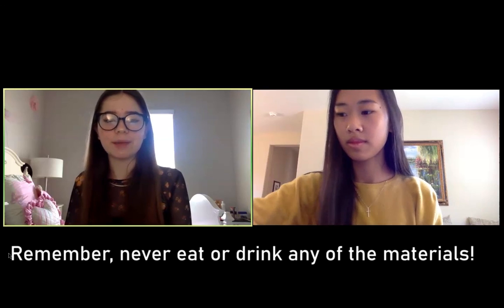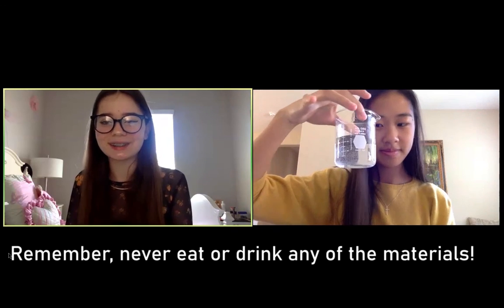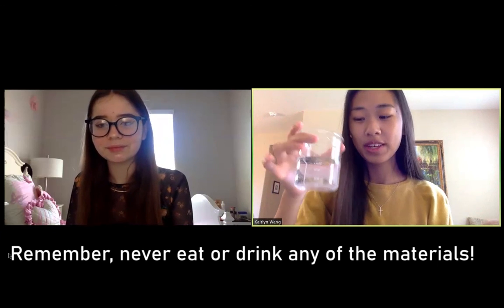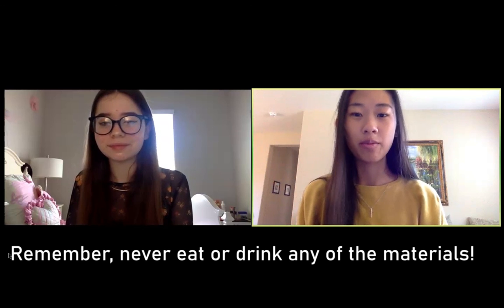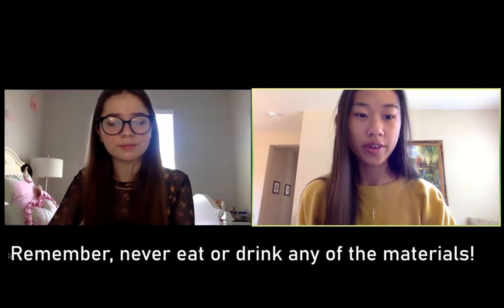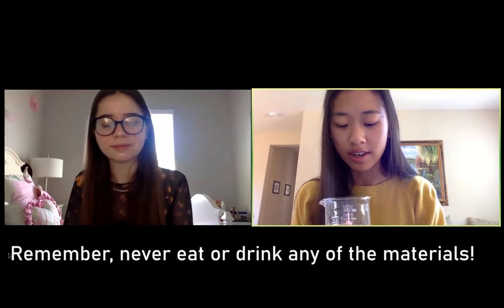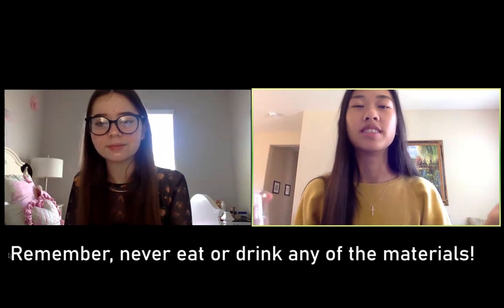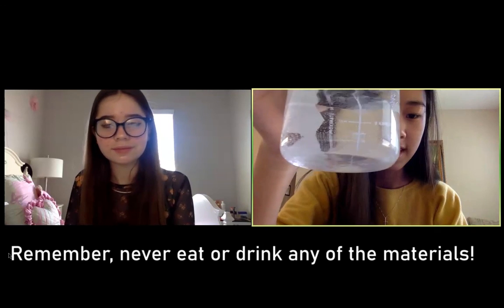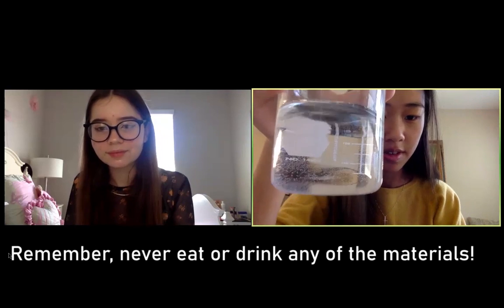And we're going to be doing the same thing for the base sample, but instead of using lemon juice, you're going to be using baking soda and a new pH strip. So this is actually like a baking soda solution. What you'll be getting is water, and we put powder baking soda in and mixed it together, which is what a solution is called. And as you can see, there's small bubbles in it that just indicate that we put the baking soda in.